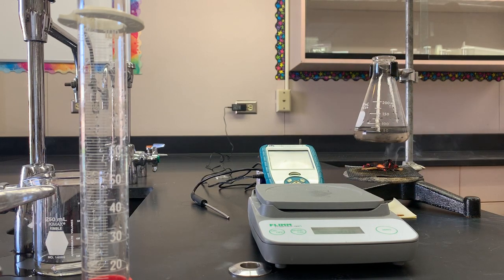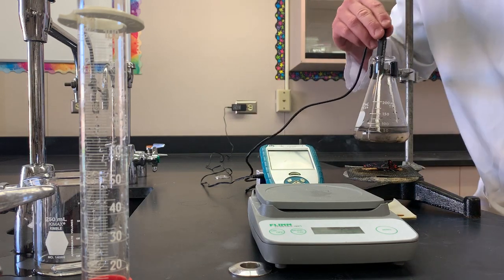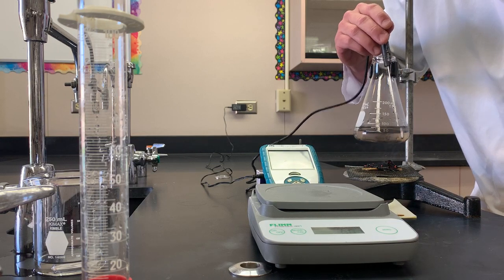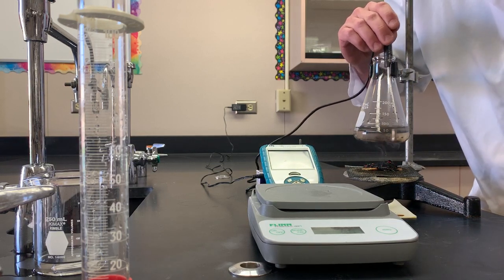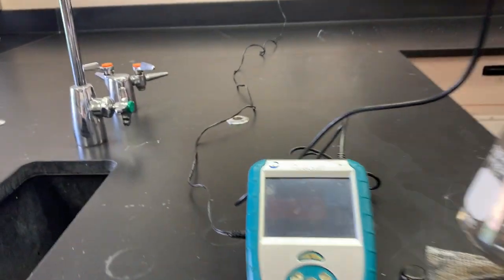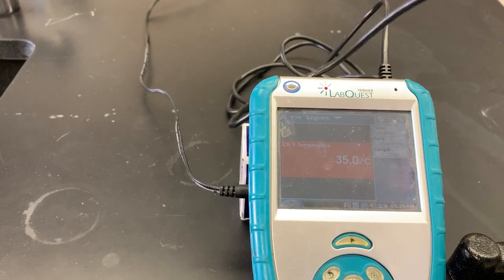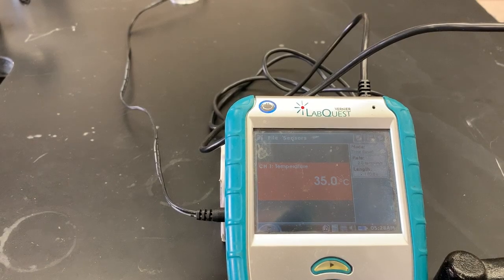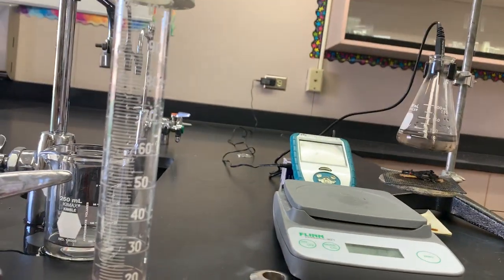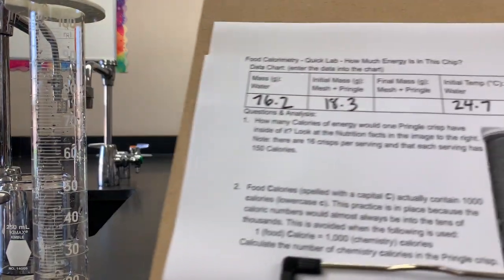Once the burning is stopped, we're going to need to mix around that heated water. Not all of the Pringle burned, but a good sufficient amount of it burned, and it's kind of a mess on that wire mesh. Using the temperature probe to stir the water in the flask, we're looking to record the highest temperature reached. Looks like 35.0 degrees Celsius is that highest temperature reached. So we're going to need to record that temperature — 35.0 in that last spot in the data chart.